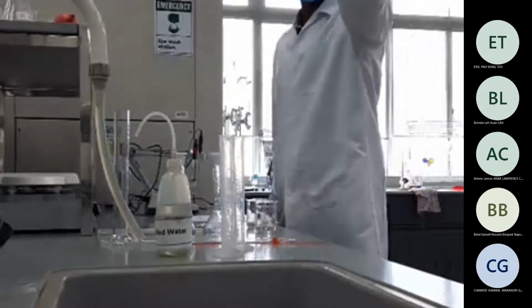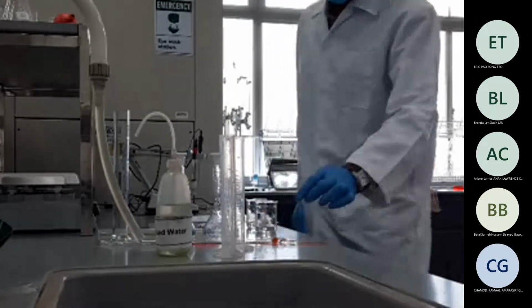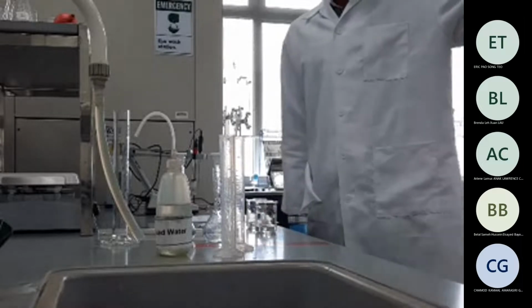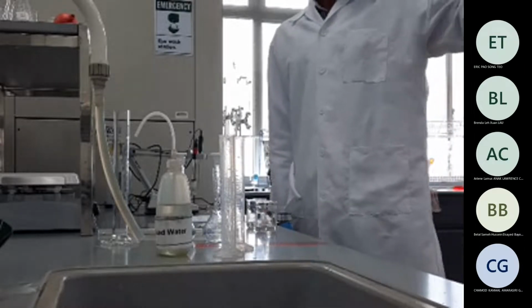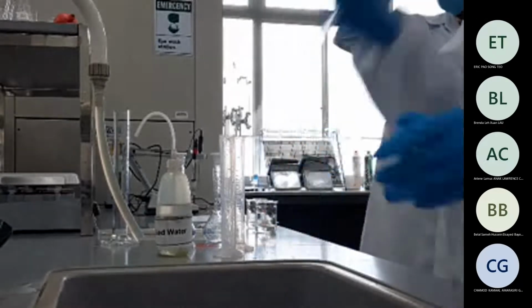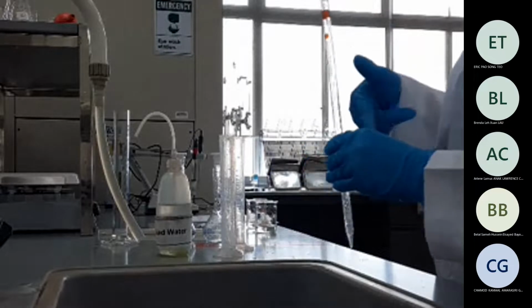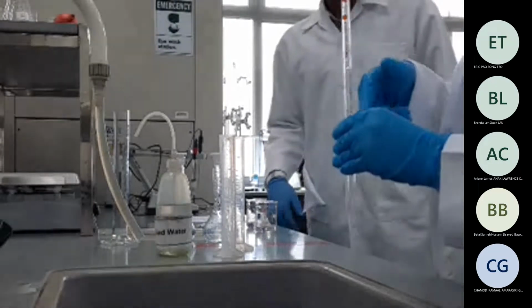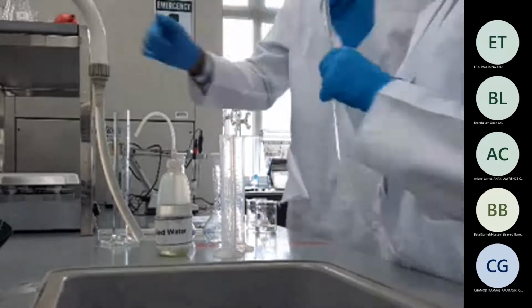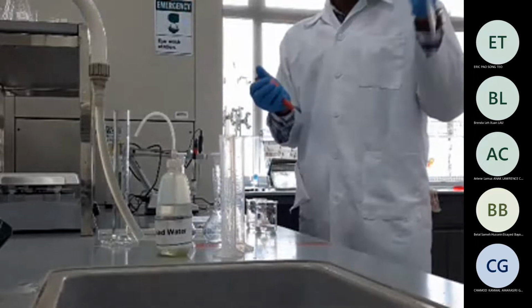There is a pipette stand there. What is given to you is 10 milliliter here. Did you rinse? Okay. Make sure that there is no excess water. It's better that you rinse it with the acid when you take it. So let me show.